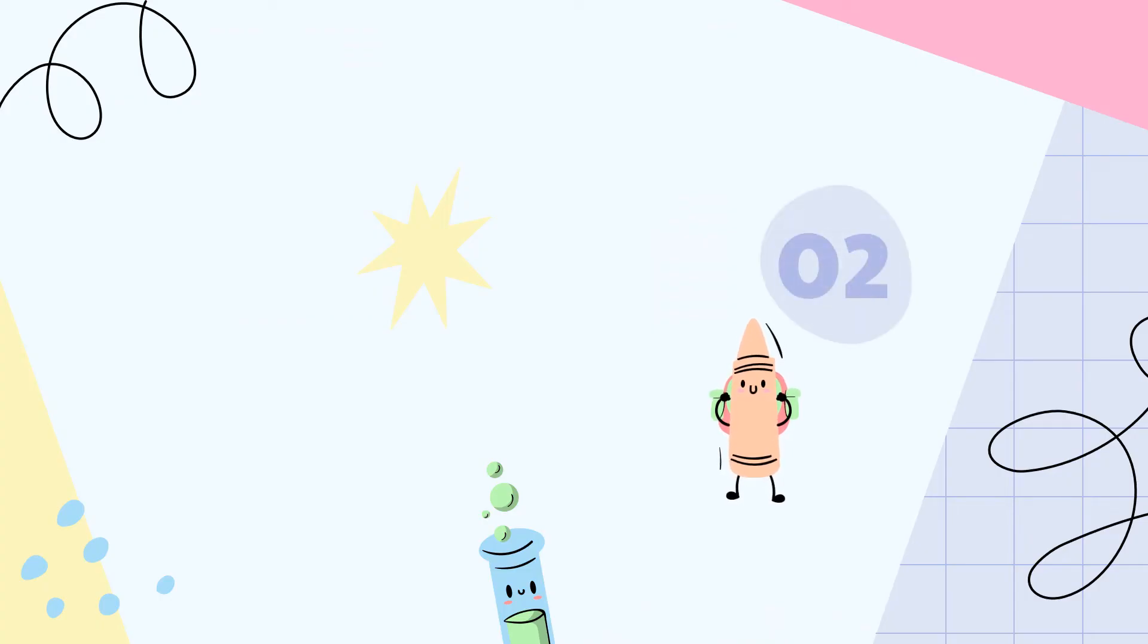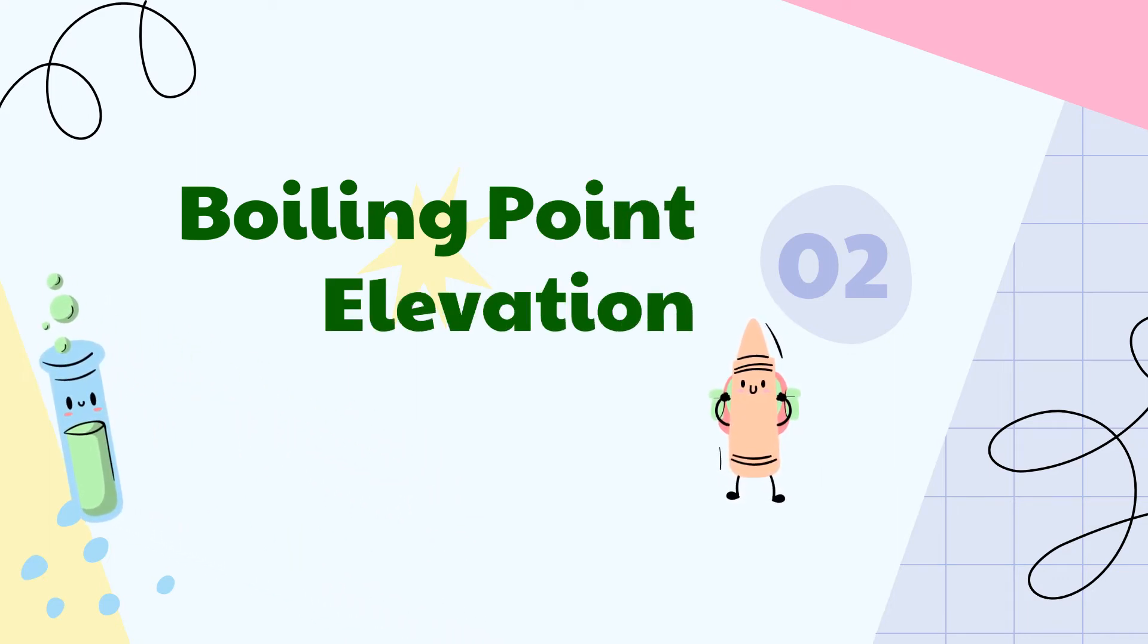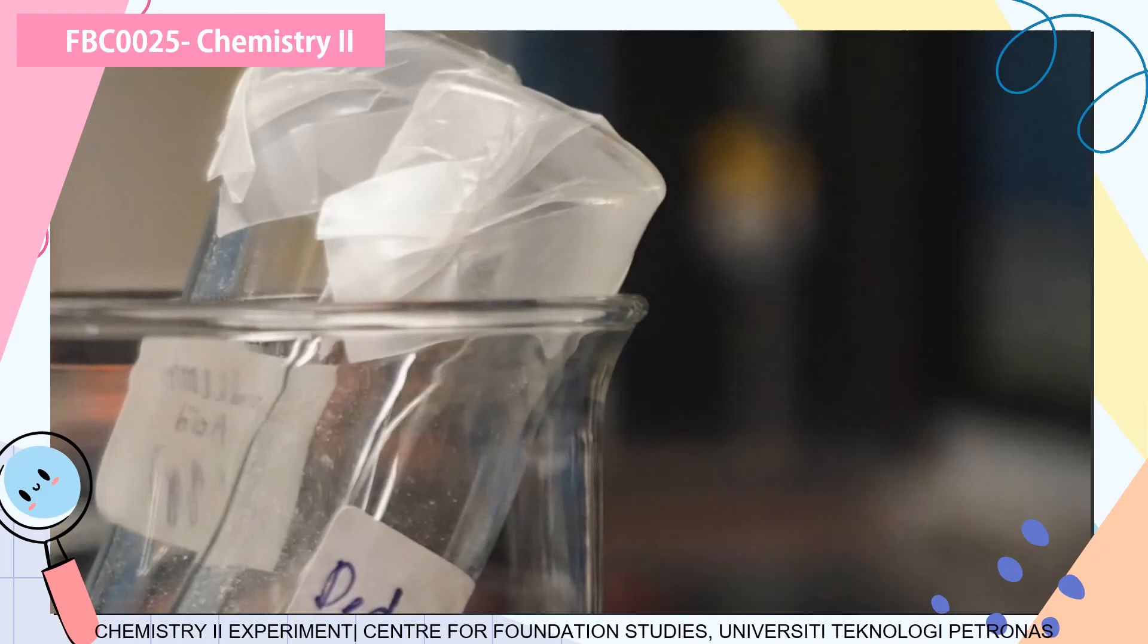That's it for the first part of the experiment. Now let us move on to the second part on boiling point elevation. For this part, we are not going to use lauric acid anymore. We are going to use water and sodium chloride as the solute. Before we proceed, I would like to remind you that you are going to use Vernier LabQuest for data collection and you must set it up before you start this second part.